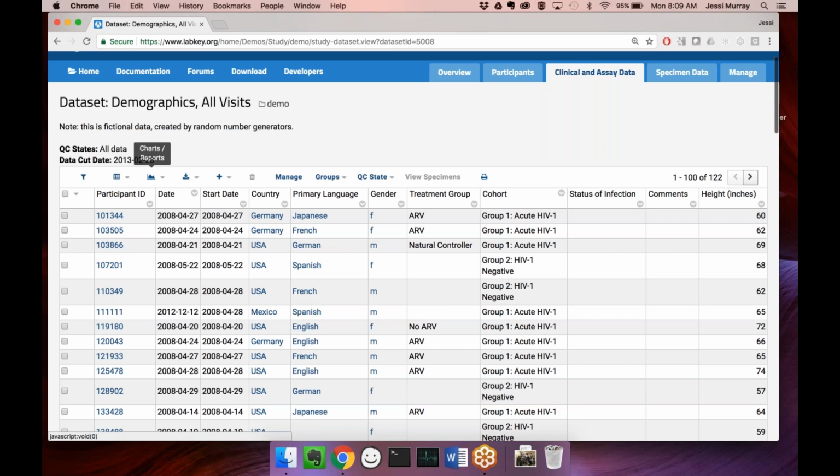One, we tried to make some of these common items in the grid button bar icon based. We haven't changed everything just because we want to ensure that the icons are sensical. So QC state, there are certain ones that we thought it made more sense to still spell them out.